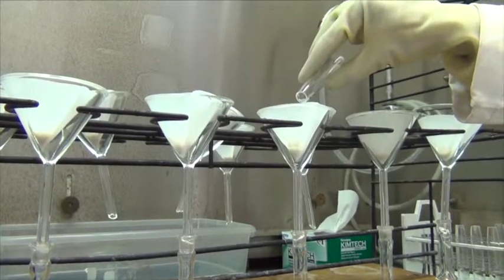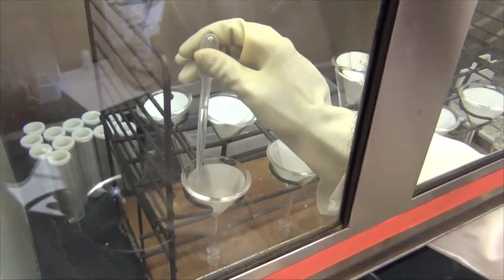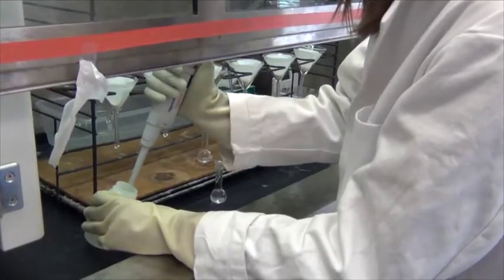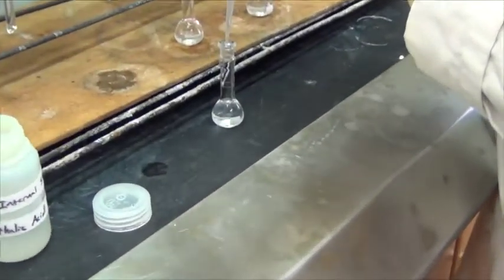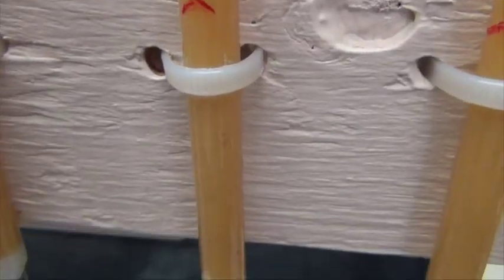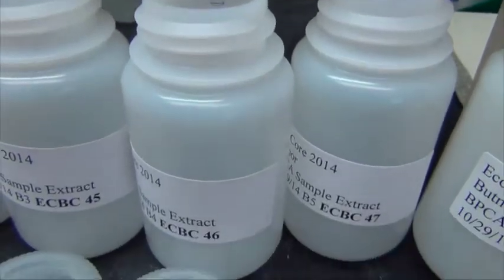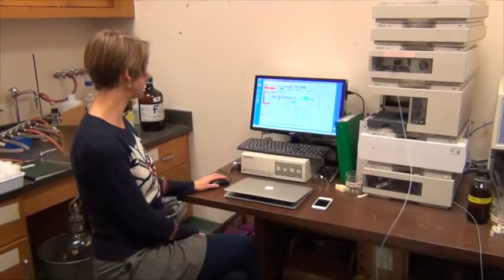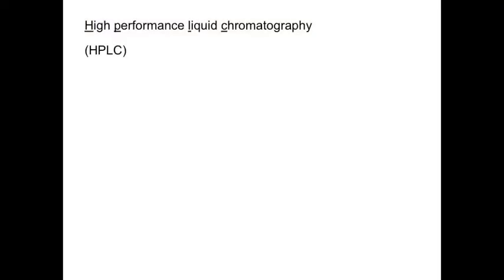Once the samples have digested, they are filtered and combined with ultra-pure water and phthalic acid. The phthalic acid is used as an internal standard. For a nice explanation of internal standards, see this website. Next, the samples are run through resin columns to purify them and remove charged, non-target material. The samples go through more preparation steps, and eventually they will be analyzed by high-performance liquid chromatography, or HPLC for short.